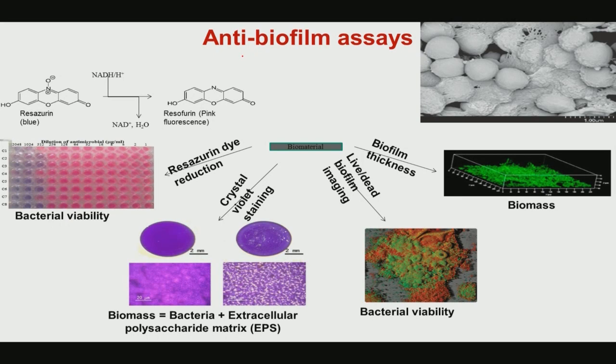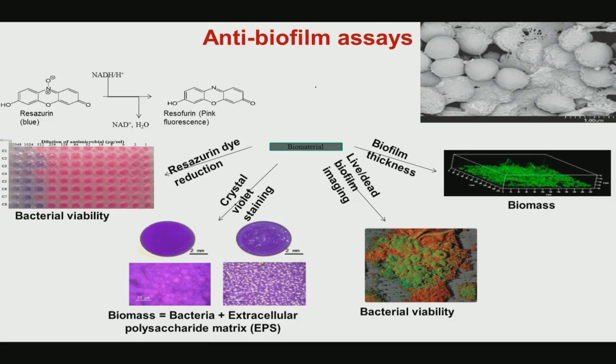The next stage is that a material may have an indication of a very strong antibacterial effect, but still a detectable number of bacteria may have the possibility to grow when cultured for an extended time period in the growth medium, and they can potentially form a biofilm. This aspect of biofilm formation I have mentioned very briefly in this module, but I have mentioned it more extensively in an earlier module where I covered bacterial growth, bacterial structure and characteristics.